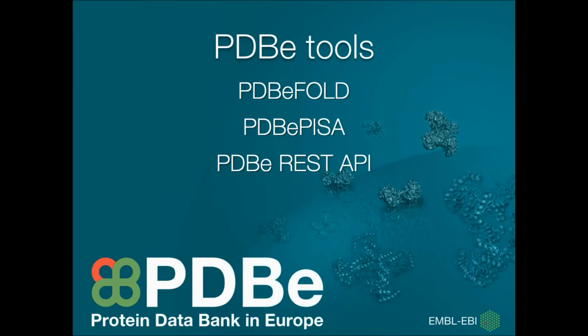There are a number of tools that we've developed here at the PDBE that you may find useful to your own research. PDBEFOLD, for instance, helps you to find proteins based on their structural similarity to a protein of interest. We also have PDBE-PISA, and this is used for calculation of the interfaces between molecules in a crystal entry and suggests which of these are likely to occur in solution.